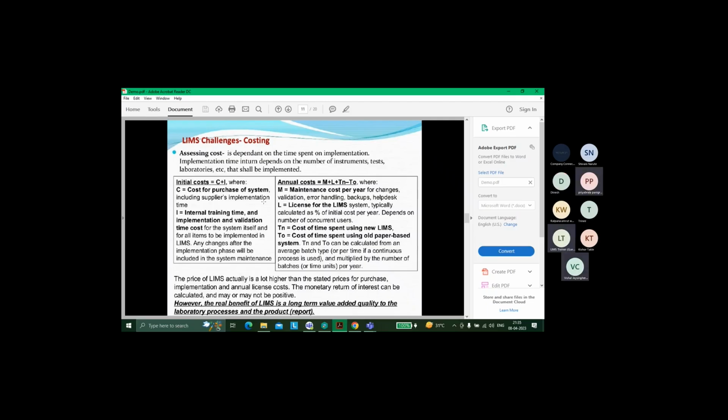Correct. These are very complicated calculations. The senior management, maybe 10, 15, 20, 30% of them, who have 25, 30 years of experience, sit and assess themselves what the costing is, what the cost would be if we take 1,000 licenses, or 10,000 licenses from that LIMS vendor. Maybe there are a lot of assessment points which we are not taking into consideration, but let us see what's written here.